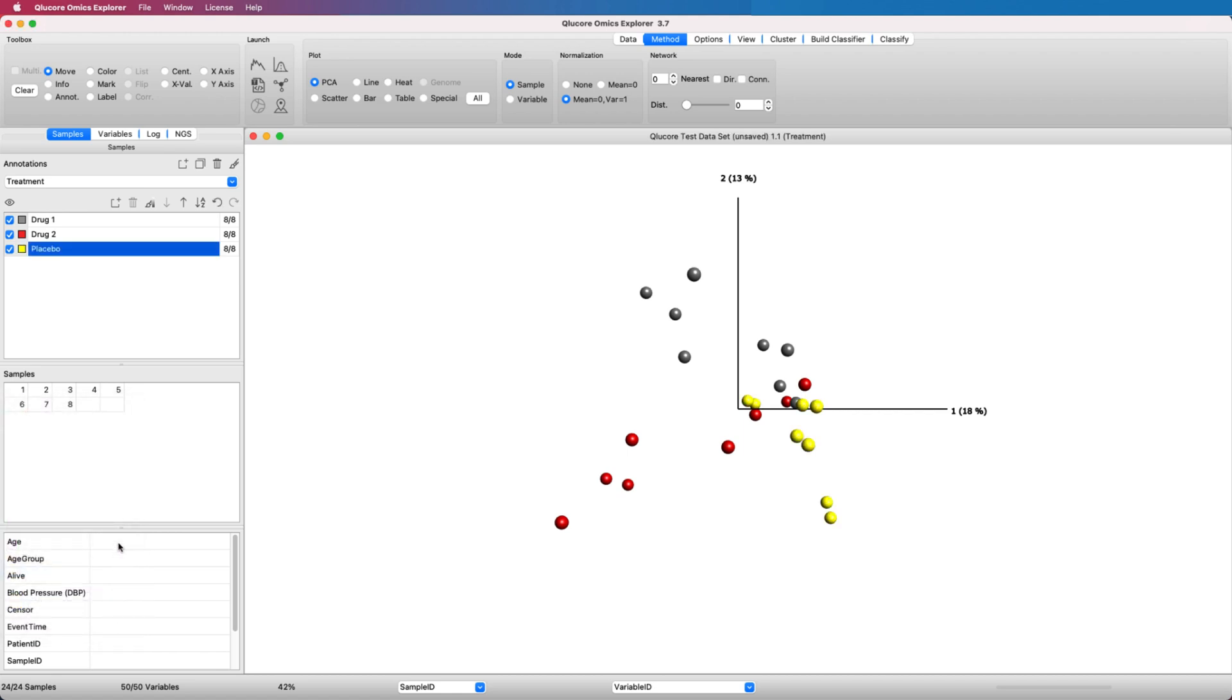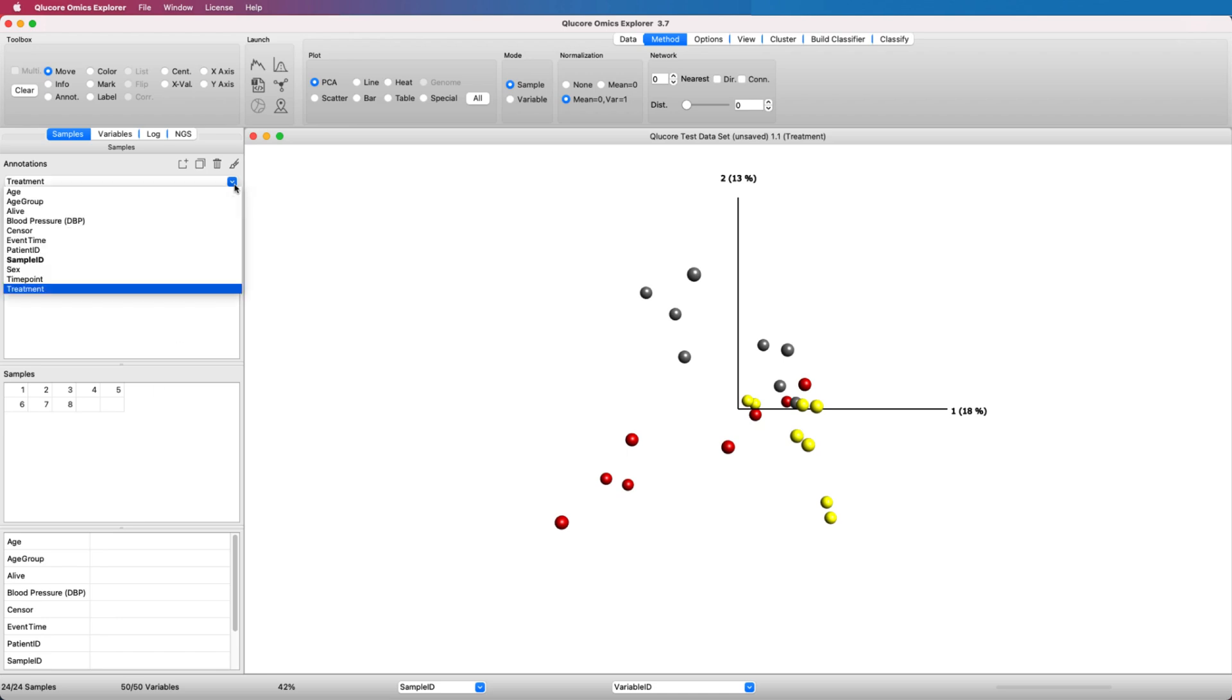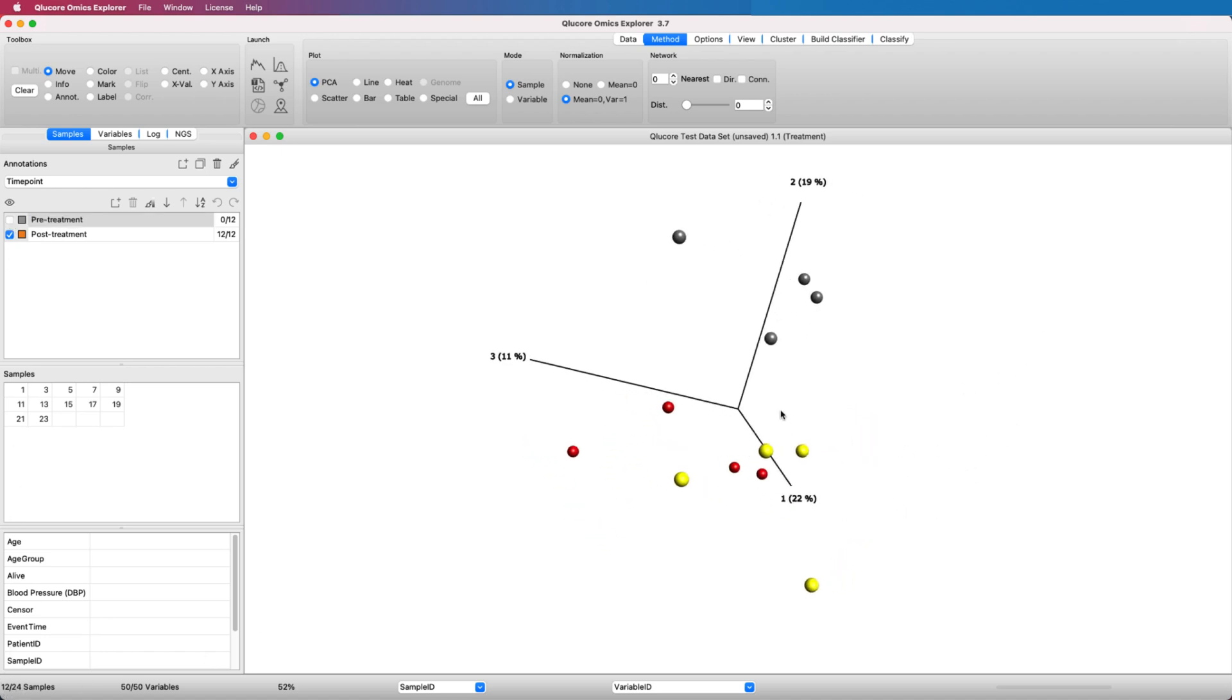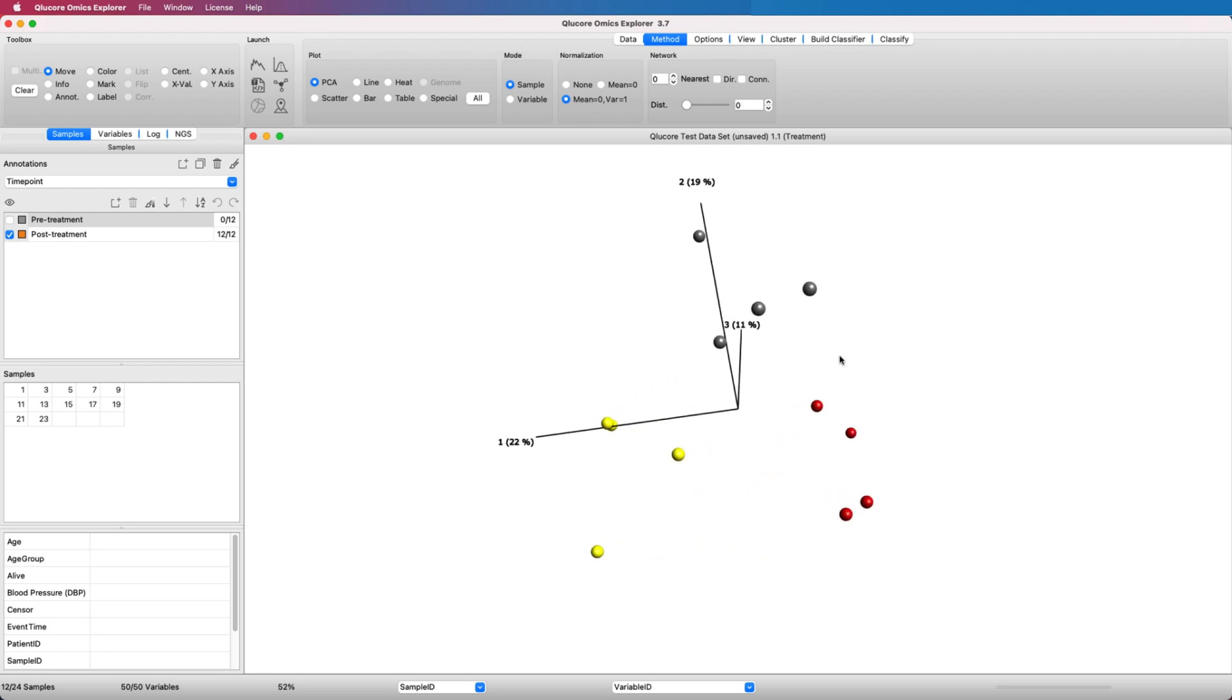We will restrict this analysis to the time point post-treatment. We do this by unticking the group pre-treatment. As you can see in the plot, half of the samples disappear, and we are now only working with the post-treatment samples.